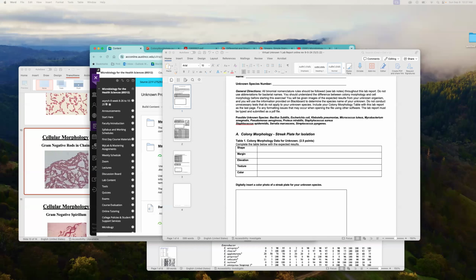All right. And when you look through here, you'll see E. coli, that's one of them. If you go up here, you're looking for Bacillus, and Bacillus isn't here. Oh my goodness, what are you going to do for Bacillus? Well, there happen to be other tables. So you have to go through these and figure these out.